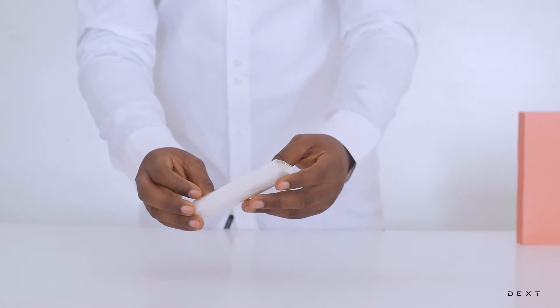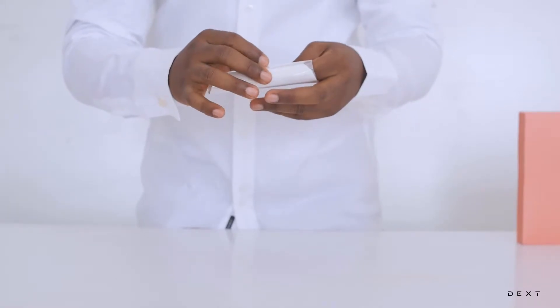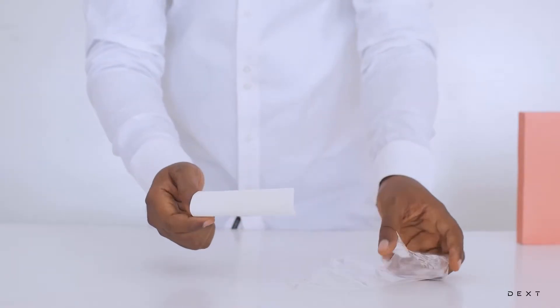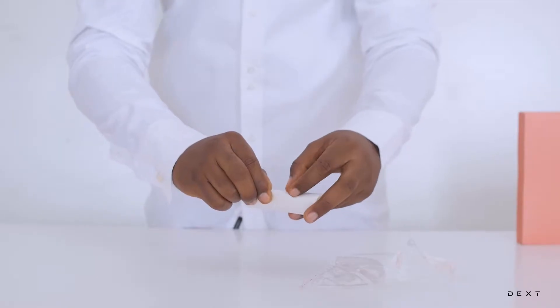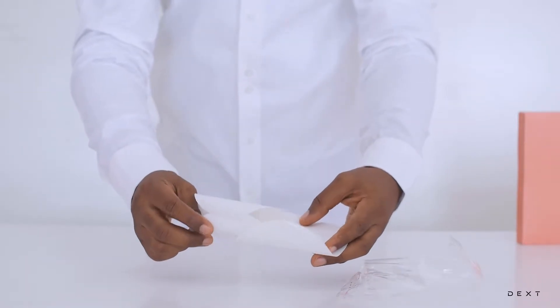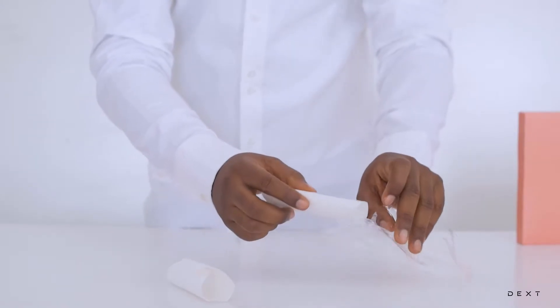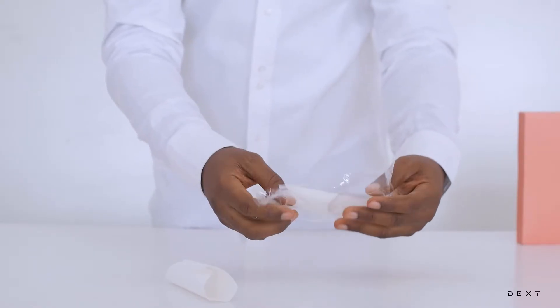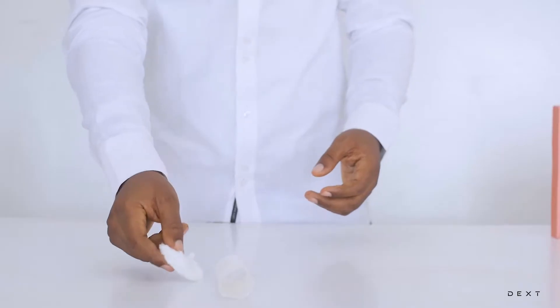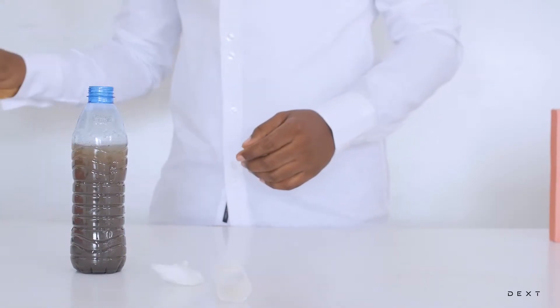We're going to mainly be needing this filter paper here, so we're going to go ahead and remove the tape from the filter paper. You're going to have two filter papers, so you're going to need just one for the activity. You have two so you can perform the activity at another time. The other thing you're going to need is some cotton, and you're also going to need two bottles.